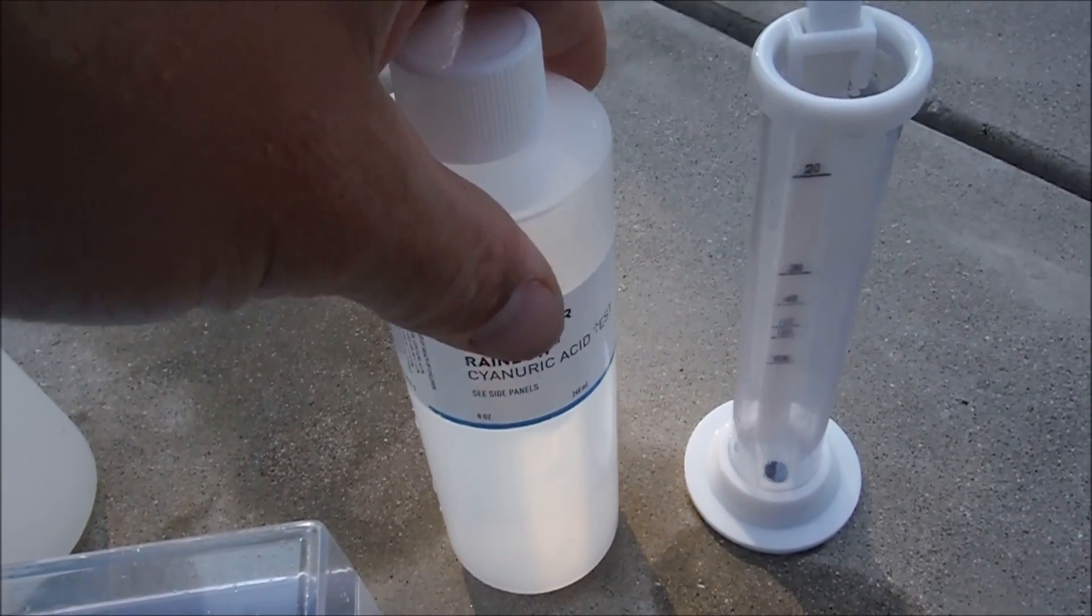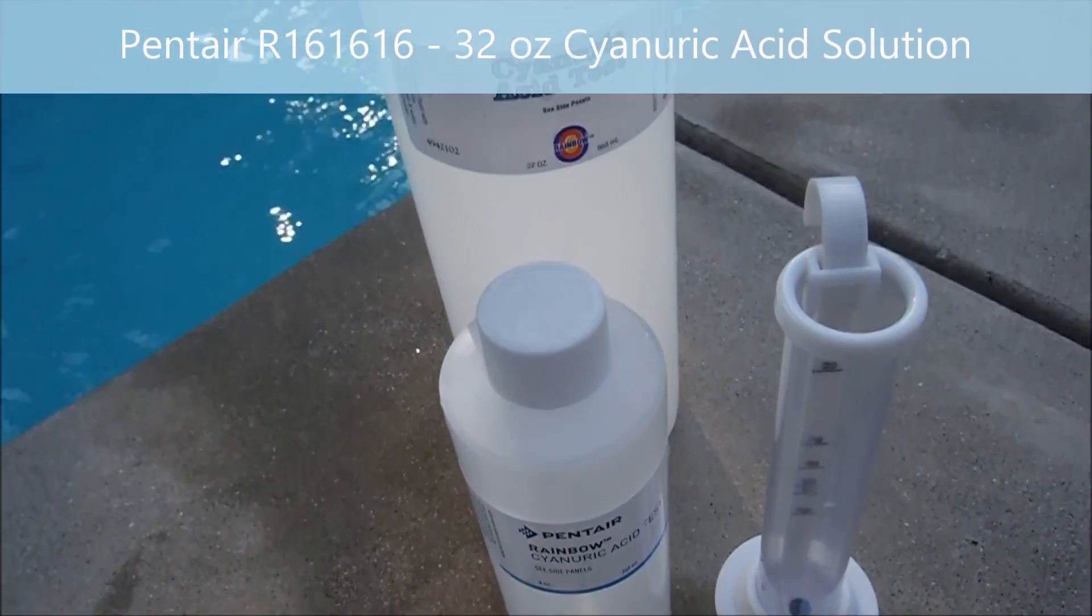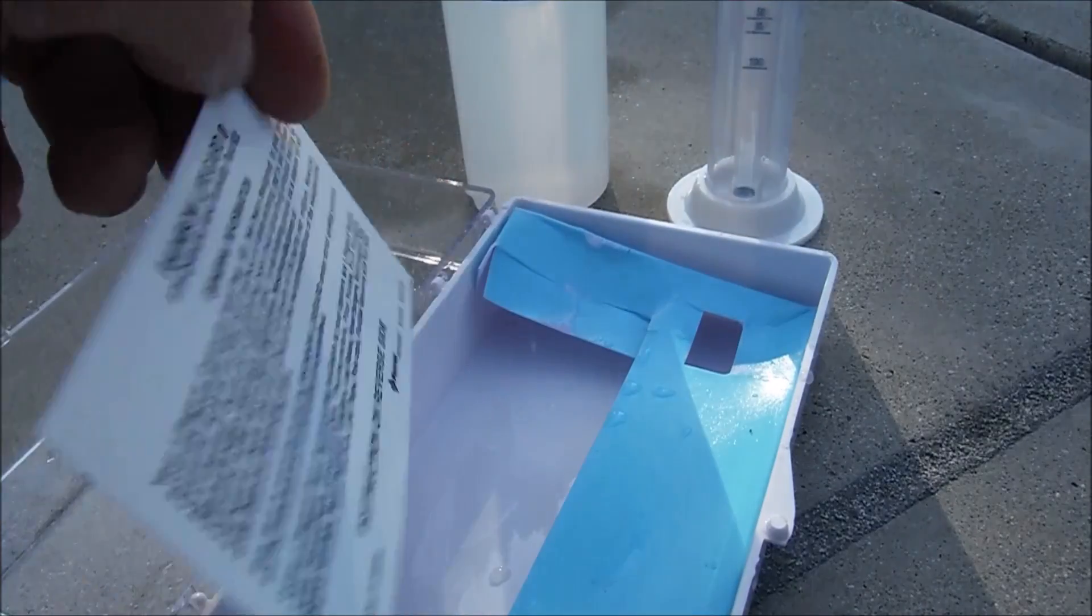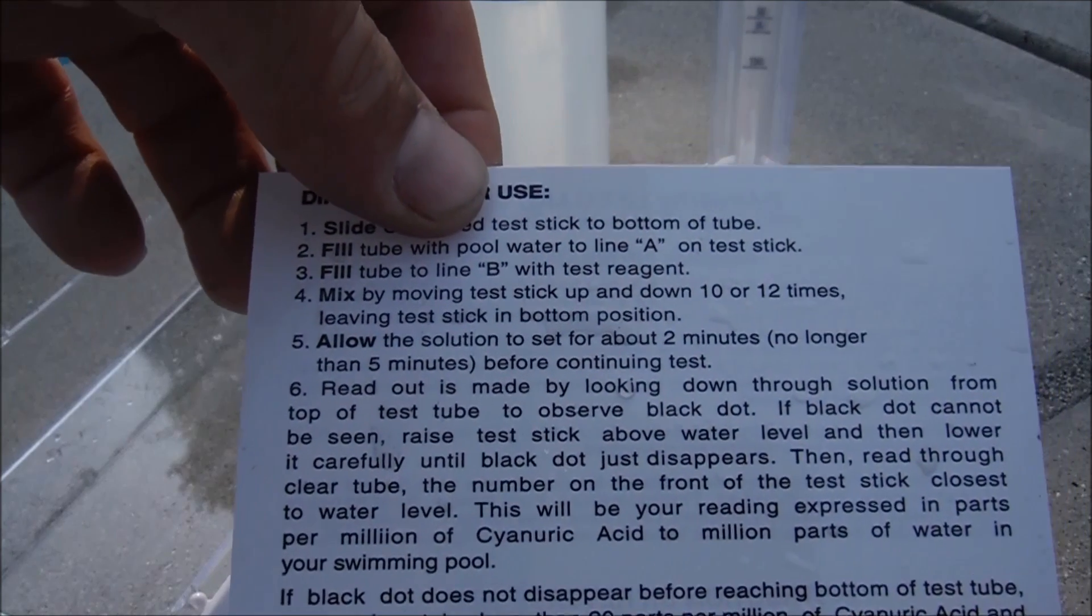Comes with plenty of solution for several tests. If you run out of solution you can also order the refill. Comes with this really nice storage case and inside the storage case is the instructions for testing also.